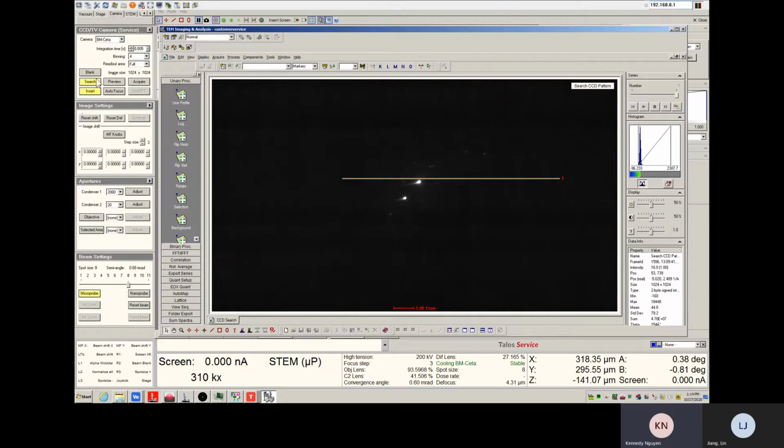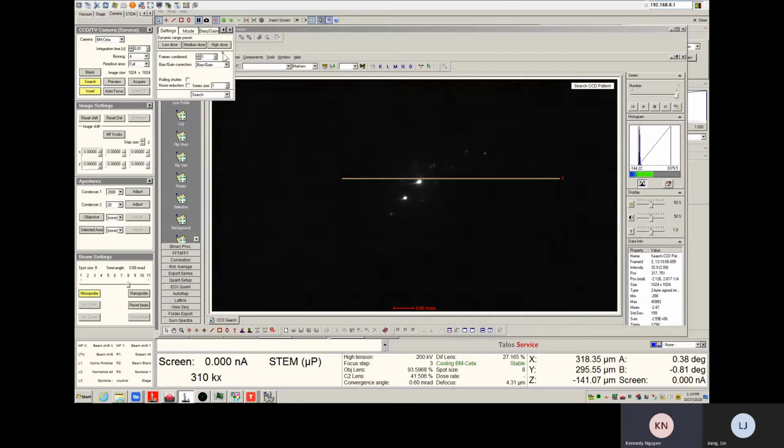Okay. All right, so we have that. So let's do, it's about 2000, right? Yeah. So we can make this 0.1, 0.01. 0.01. Okay. It'll be about 4000. Okay, and then we did high dose.